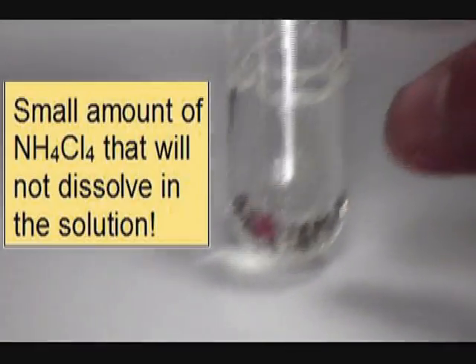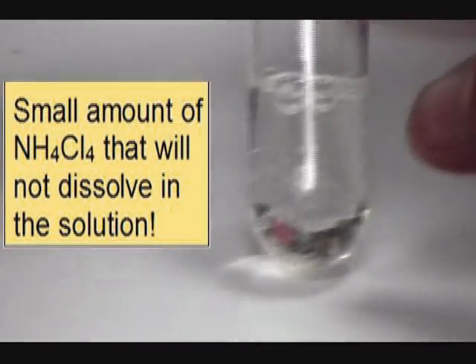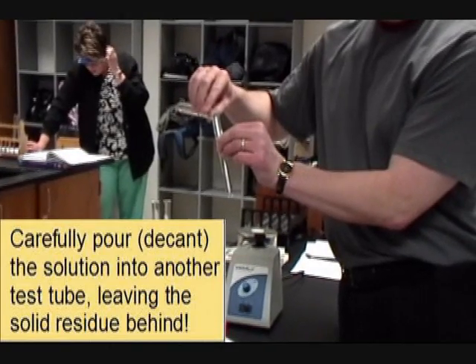A small amount of solid still there. Is that clear? Yeah, I think so. Make sure she gets the content. All I see is 6M up here. There's a 6M HCl.